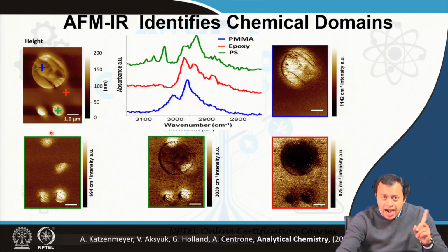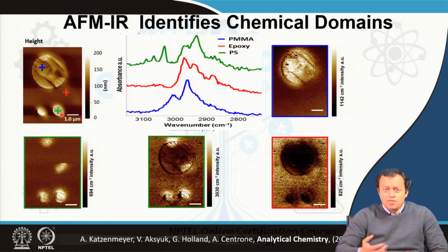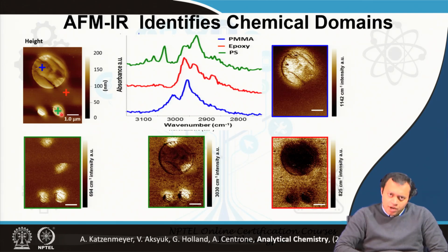Even if one atom, a group of atoms, can be measured, can be imaged using AFM, then I can image coronavirus. A virus for us nanotechnologists is an organic nanoparticle, a complicated organic nanoparticle, but a nanoparticle nonetheless, 100 to 200 nanometer length scale, and that is okay for us. Again, pluck a piece of your hair and do that formula that I told you to understand what is 100 nanometer compared to it, and therefore the size of the virus.